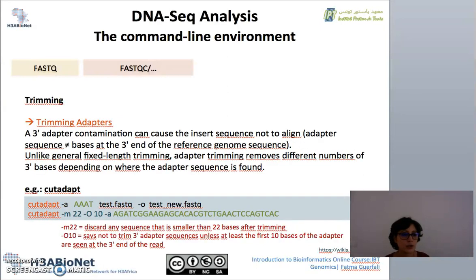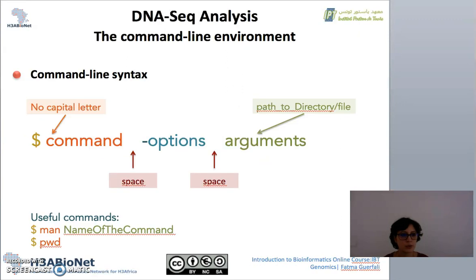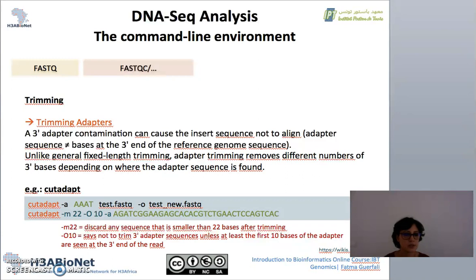Now, there are also other tools that can be used for trimming adapters. This is very important because otherwise the other sequences may not align. So you have here a way to ask for that specific pattern to be removed from this file, and the result should be output in that new file. And you have also another example showing that there are many options that could be related, and you have the explanation of it if you want to go further into the details of it.